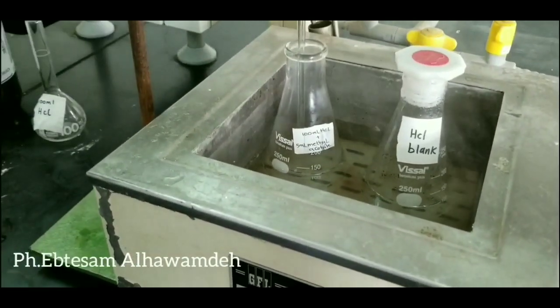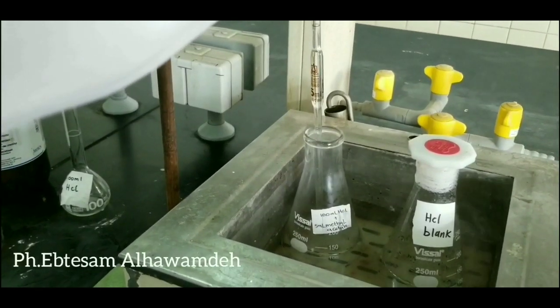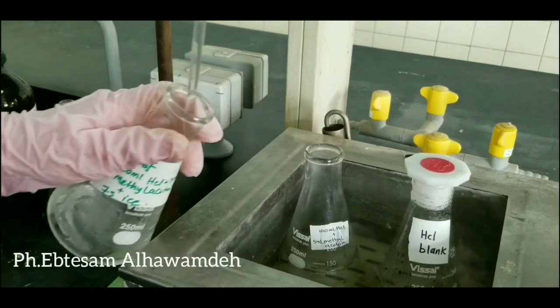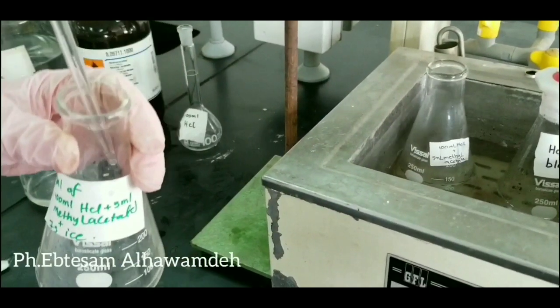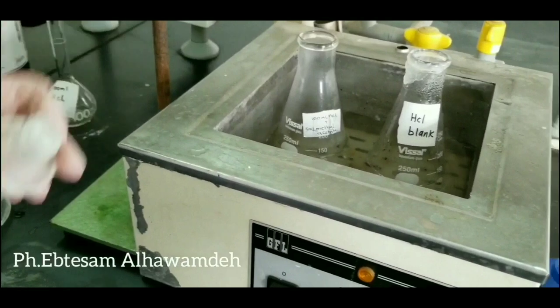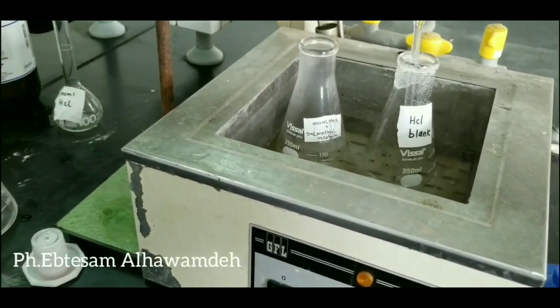Sampling. Remove 5 ml of sample of the reaction mixture according to the time schedule given by your instructor. Replace with 5 ml of fresh HCl.